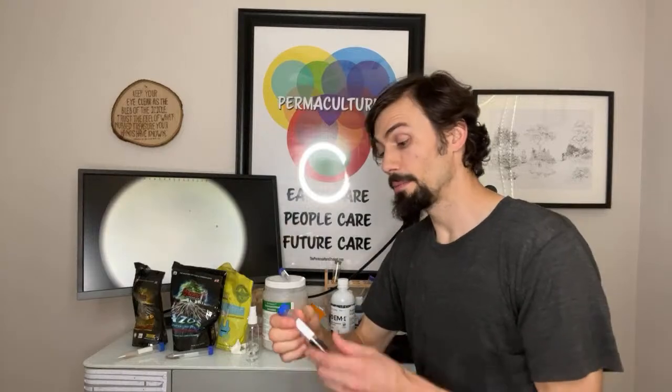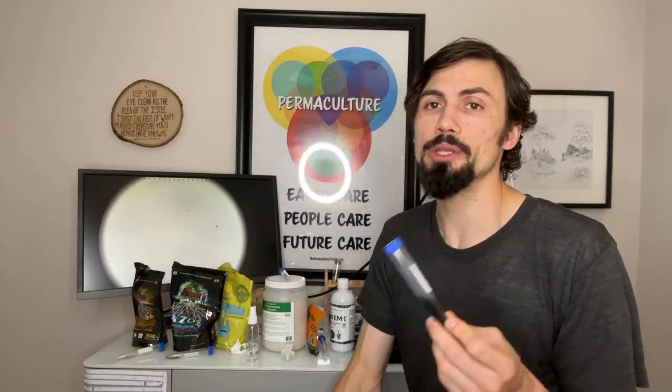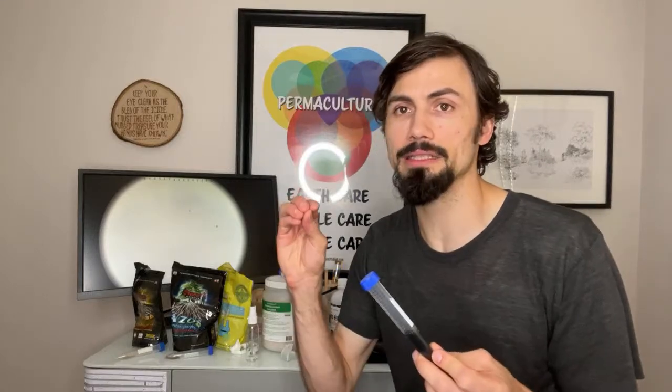All right, well, I look possessed, so I'll come back to here then. I will be distant from the camera. But basically, all I'm trying to say is that when you visualize this, it'll create spectrum tunable scopes, but you would have to affect the actual lens, the emission filter.